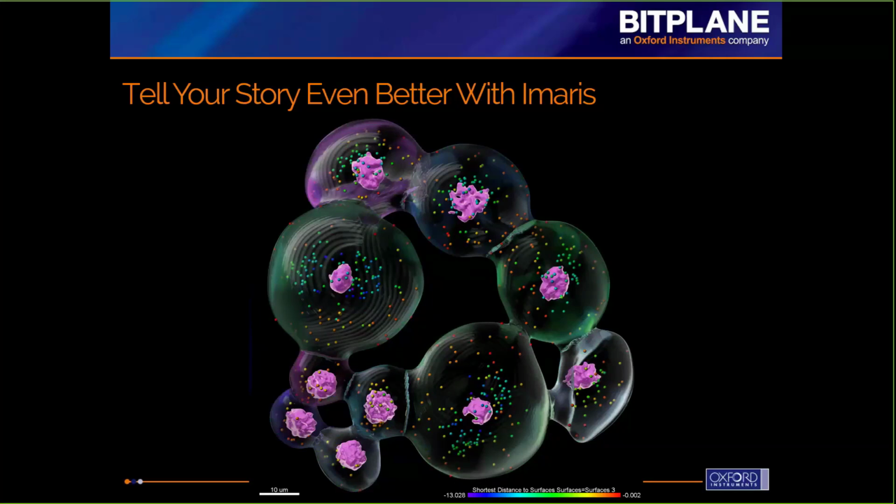And so this is an example of an improvement we've made for surface rendering. This is a type of rendering that's included. We have a few different presets here. And what you're able to see now is that the segmentation for the cells, we've identified those. You're seeing them rendered as this transparent, glassy type of rendering.